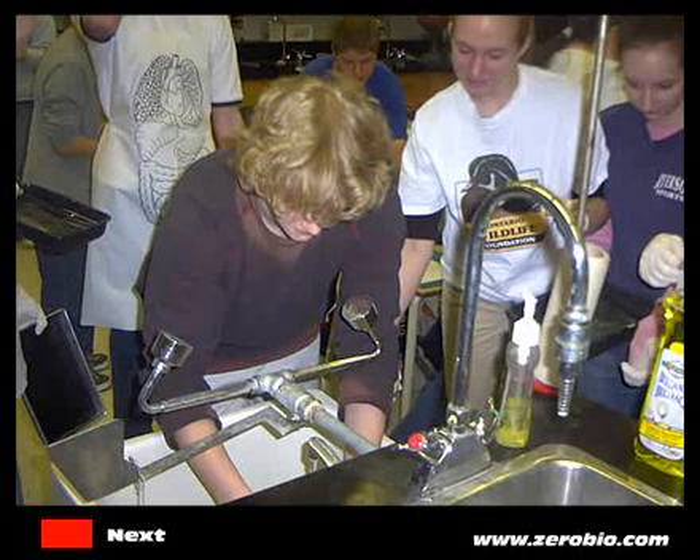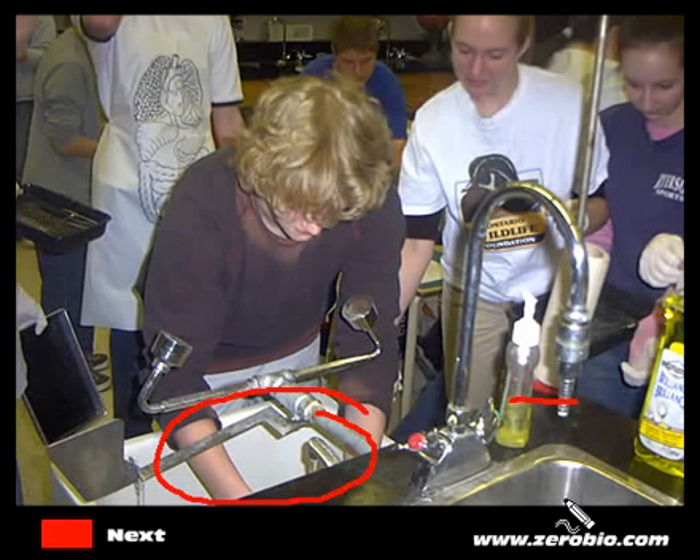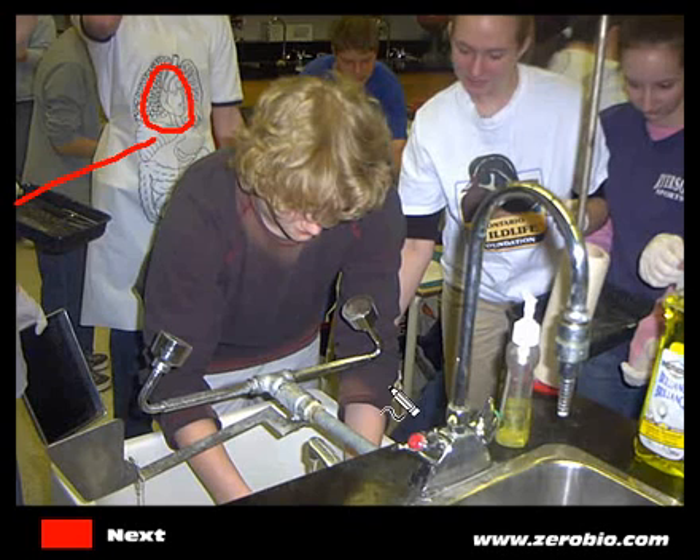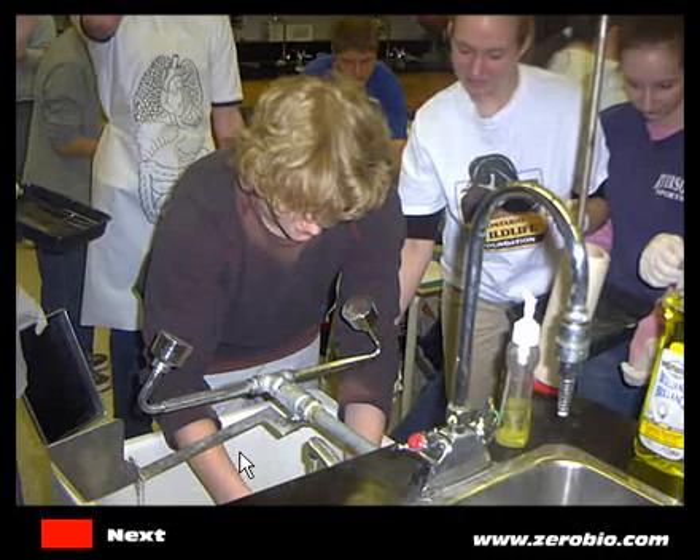Hi folks, and welcome to another video tutorial. We're going to have a look at the sheep heart dissection. As you can see, we've got some students getting ready. The first thing you want to do is wash off your sheep heart — preferably up at the front sink. There is soap available for washing up, but don't wash the hearts. We also have these trendy plastic aprons available for you to wear if we've got them.